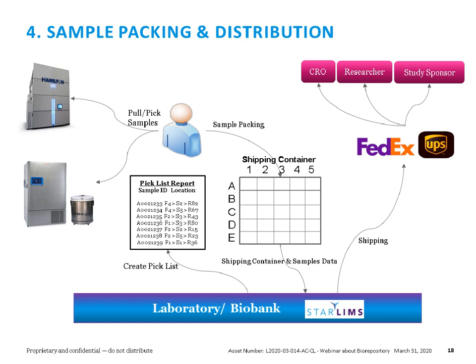And all of this data, the pulling of the samples, shipping, putting the samples in some kind of container for shipping, all of these processes are being tracked in STARLIMS. Remember the chain of custody data, the who, the when, where, all of these questions, are going to be captured in each of these processes.